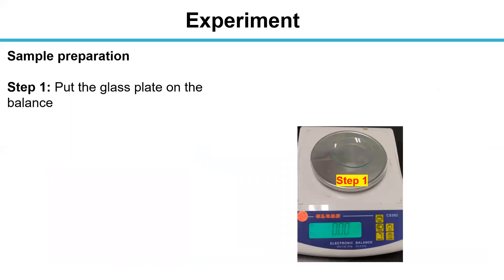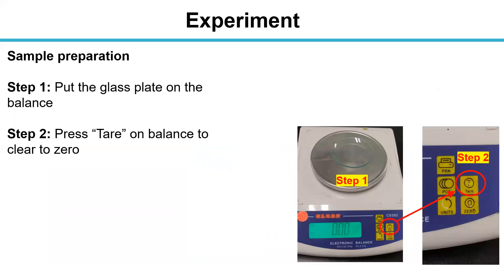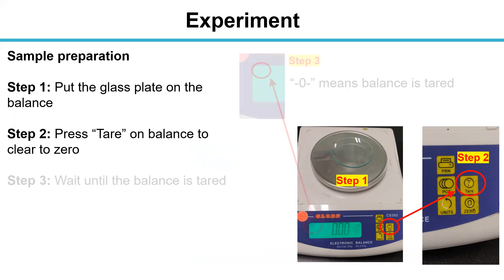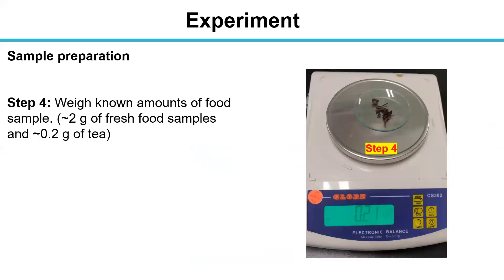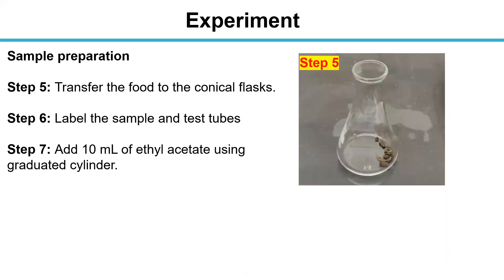Now we will start our experiment. First, we calibrate the balance. Put the glass plate on the balance, then press tare on the balance to clear to zero and wait until the balance is tared. You can see zero on the screen, which means the balance is tared. For sample preparation, after calibrating the balance, we weigh around 2 grams of fresh food sample and 0.2 grams of tea respectively. Then we transfer the food to the conical flask and label the sample and test tubes.